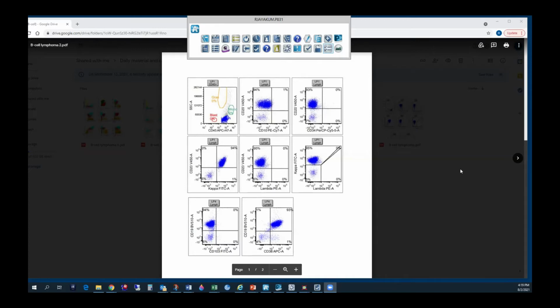I found one of the most challenging things, especially in bone marrows, which are really hypercellular, is that it's so hard to divide where the population could be, especially if the neoplasm cells are not that many, to find them behind all that normal population.